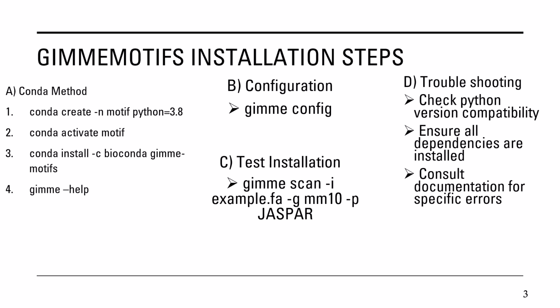One of the things that actually helped me when I was getting this package installed onto my own device was constantly looking at the documentation and also consulting AI tools so that I could look at different solutions and type in different errors to find different fixes in order to configure the correct kind of environment so that I could run the correct kernel in my Python environment when I was creating some Jupyter code. And I found that to be very useful as well.